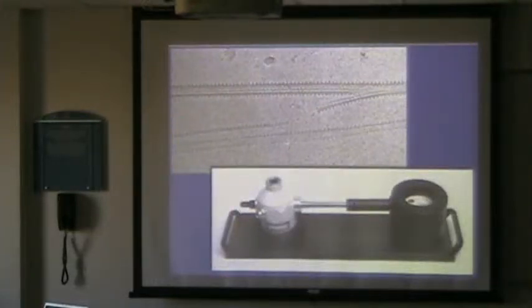And that's about how a microtubule looks like in ice, compared to the structure before. Now this is not an open-end microtubule anymore. This is really a compact tube. And you see here the protofilaments, and these little T's which come off are 40 kilodalton motor protein. That's a kinesin motor head domain, which is a protein blob of about 40 kilodalton.